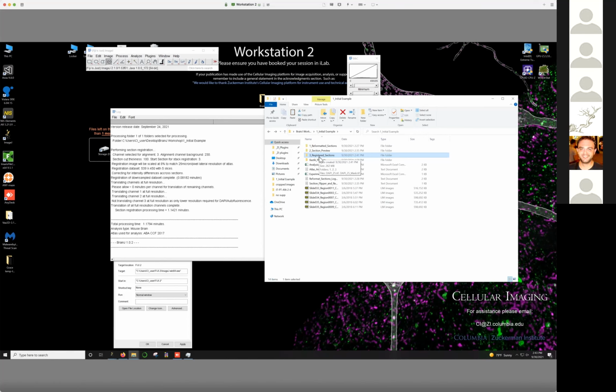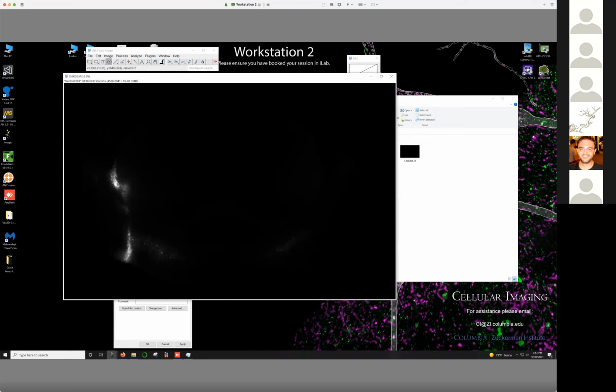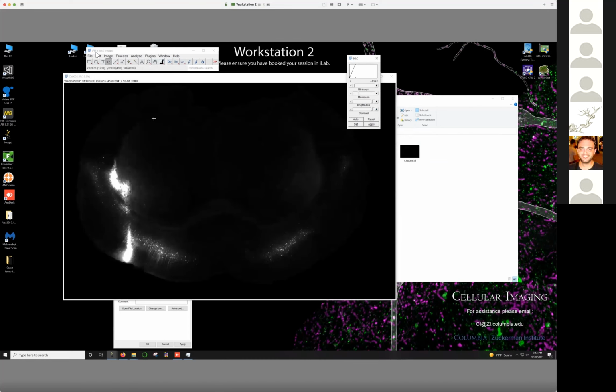Now, if we wanted to actually analyze the cells, let me show you. I have to try and find a good area just to explain this. I'm just going to duplicate this region here. So I'm just pressing Control-Shift-D to duplicate this region.